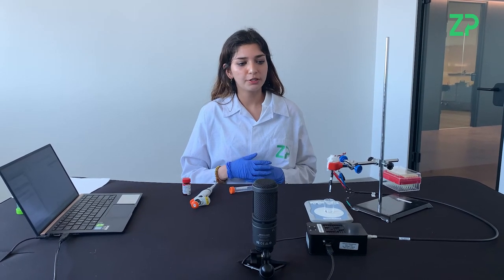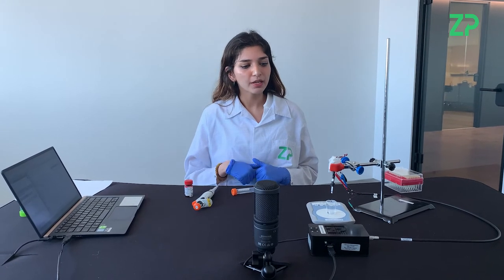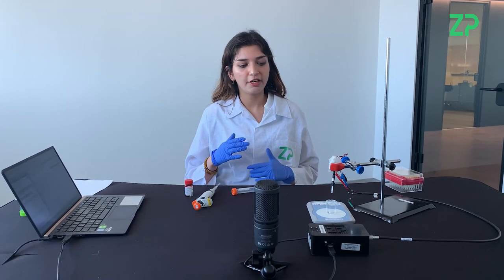Hi, my name is Siobhan and I'm a scientist at Zimmern Peacock. Today we're going to be doing a demo experiment for our lactate generation 2 sensor. For this experiment there can be two types: a drop test and a beaker test, and today we're going to be doing a drop test experiment.